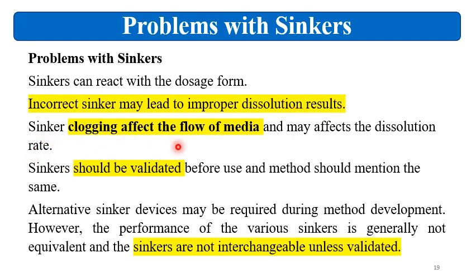Sinker clogging affects the flow of media and may affect the dissolution rate. Sinkers should be validated before use, and the method should mention the same. Alternative sinker devices may be required during method development. However, the performance of the various sinkers is generally not equivalent, and the sinkers are not interchangeable unless validated.